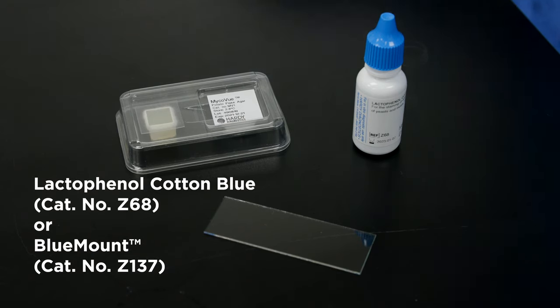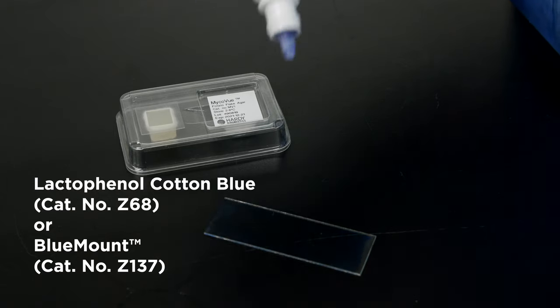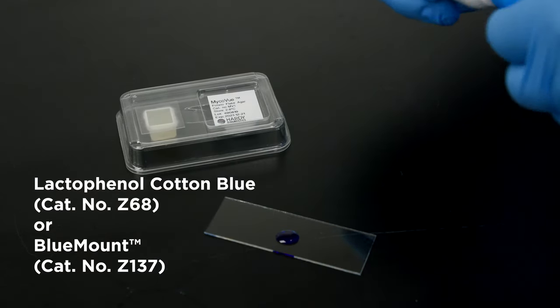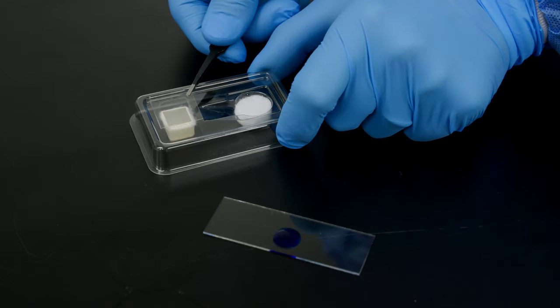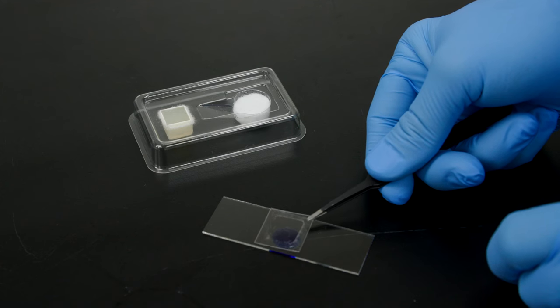Alternatively, you may stain the fungal growth adhering to the cover slip. Do this by placing a drop of lacto-phenol cotton blue or Hardee's blue mount on a glass microscope slide. Then remove the MicroView cover slip and place it on the slide for viewing under the microscope.